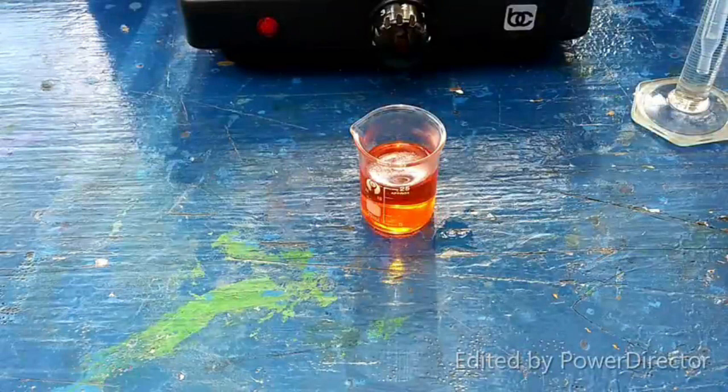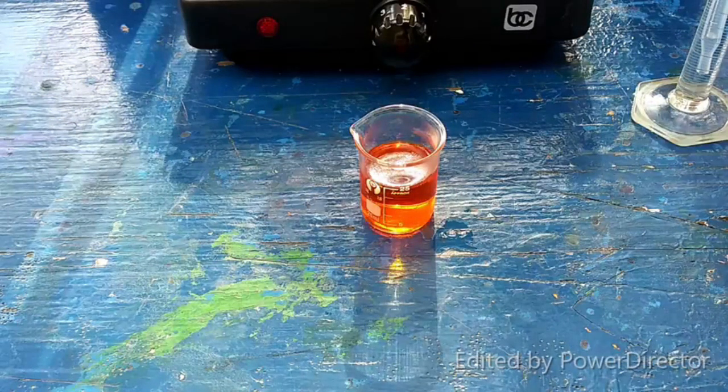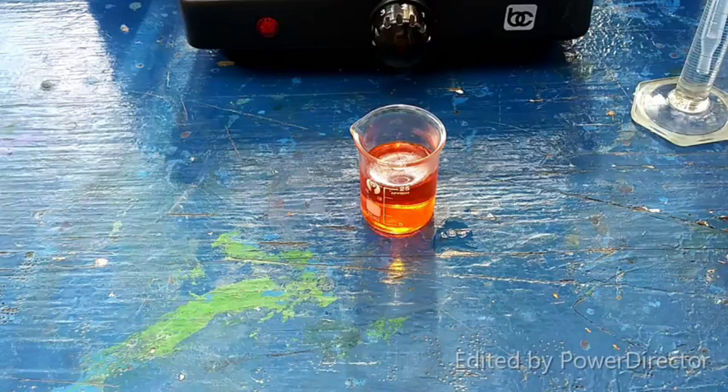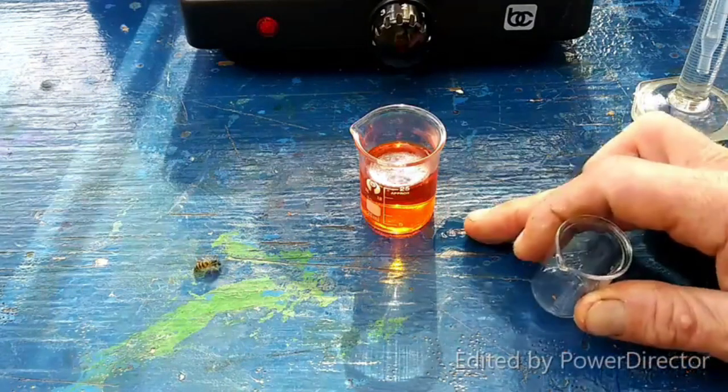All right, everyone. Here is our stock solution of hexachloroplatinic acid. It's very nice, has a nice orange color. It's very pretty. I really like that color. Anyway, our first experiment is in homage to my continued obsession with cesium and rubidium because they're awesome. We are going to make dicesium hexachloroplatinate just because. What it's going to require is a combination of 1 milliliter of this solution.